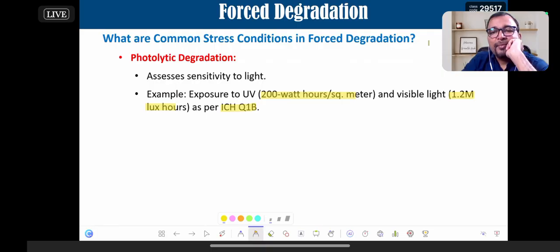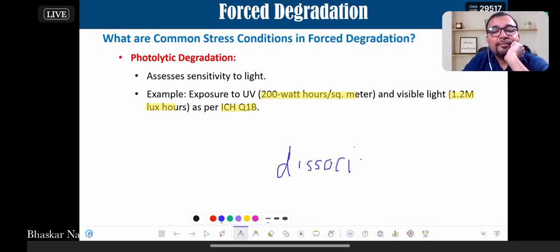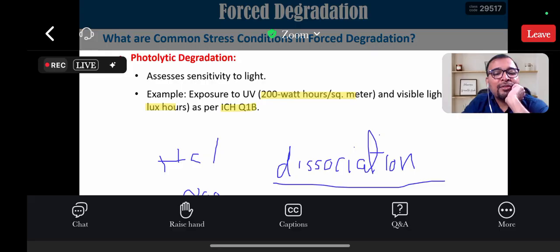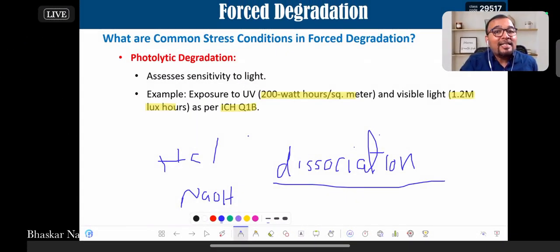Thank you so much. Naresh is asking why acid hydrolysis is conducted in water. Because to get acid hydrolysis, your acid must undergo dissociation. So you must select a medium in which your hydrochloric acid or your NaOH base can undergo dissociation. Otherwise, they will not act as acid or base. So aqueous medium is the best medium for their dissociation or ionization. That's the reason hydrolysis should be conducted in aqueous solution.